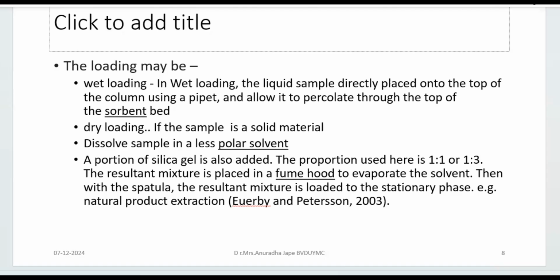So of course, this is said to be the most satisfactory method because a pre-decided volume of your analyte is mixed with a pre-decided, prefixed volume of the mobile phase, and in a controlled manner, it is layered onto the column. And so it is the most satisfactory and chosen method.